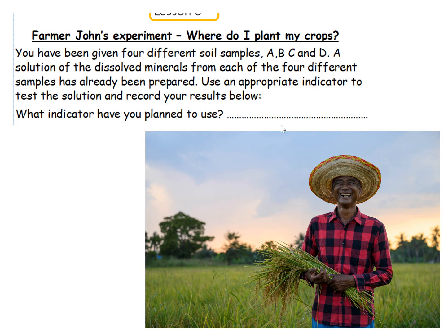So have a think, what indicator would you use? Some want a strong acid, some want a weak, some want a strong alkali, some want a weak. So which one would you want to use? Hopefully you would say universal indicator.